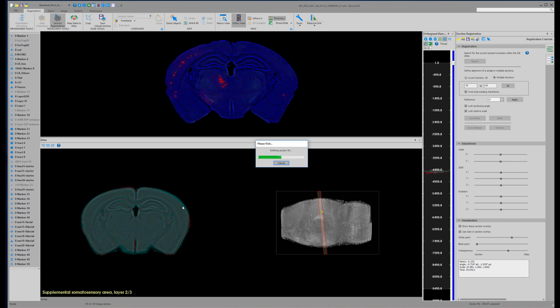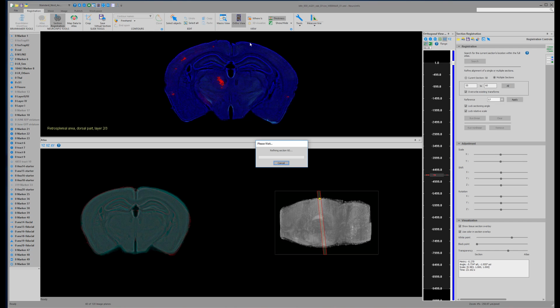And do you typically always use the nonlinear transform after the linear transform? Yes. Again, this is a good example where it's not matching exactly, because all the linear transform does is apply a linear transform, and so the nonlinear allows for some better warping.